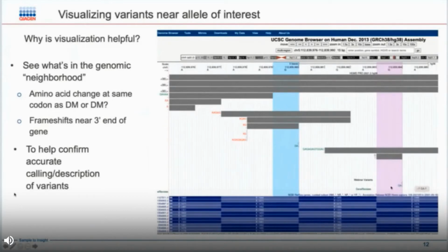And so I would know to follow up, maybe with Sanger confirmation, to make sure that this is in fact the variant I want to look at, and that it doesn't need to be altered in my secondary analysis to actually reflect something that's been reported in the literature as a disease mutation. So you can see how having this visualization makes this type of analysis quick.